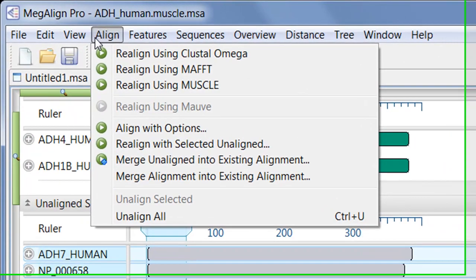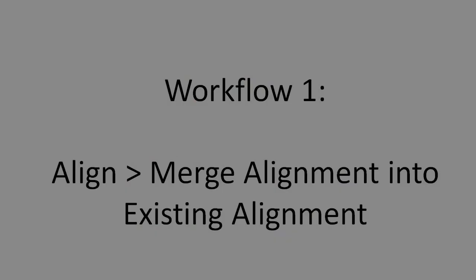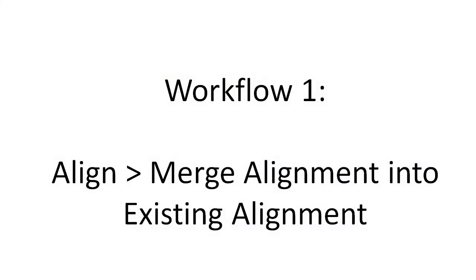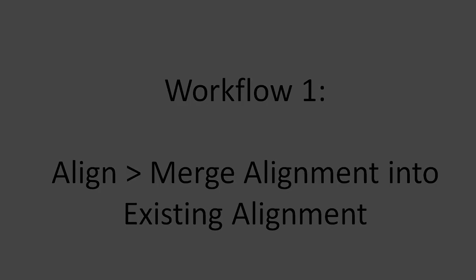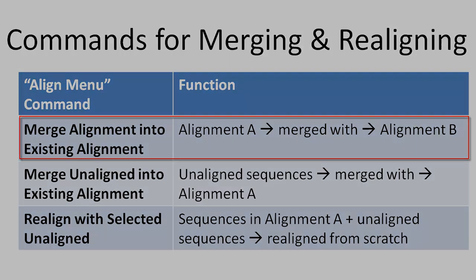MegAlign Pro's Align menu offers commands for joining existing alignments with each other or with unaligned sequences. In Workflow 1, I'll demonstrate how to use the Align, Merge Alignment into Existing Alignment command. This command is used to merge two completed alignments together, a procedure known as a profile alignment.